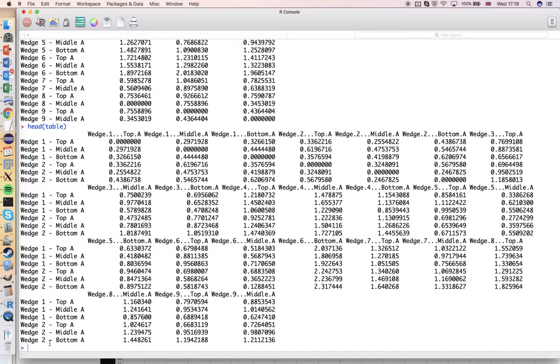Okay, now we just need a few little commands to turn this into a tree. First one, we're going to cluster it. So we're going to make a new object called class with a little arrow, and we're going to type this.